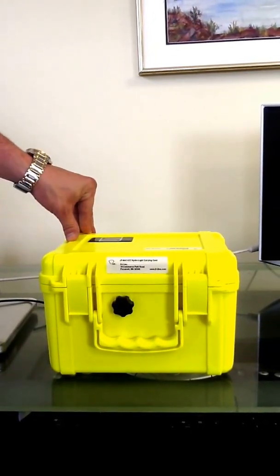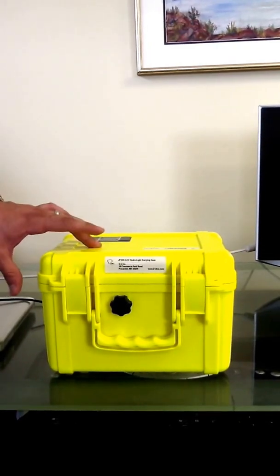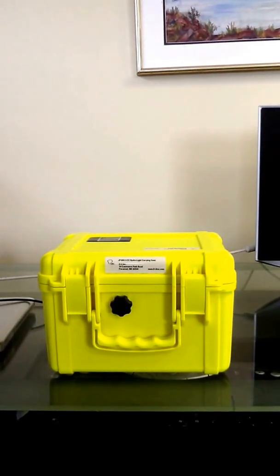This is the D2 Incorporated JFWA-1 Hydrolite demonstration video. This box is the carrying case for the JFWA-1 Hydrolite.